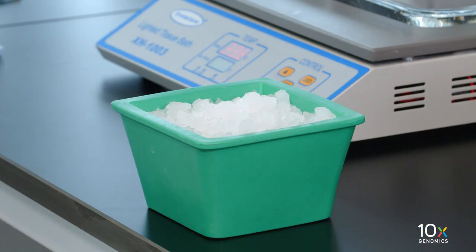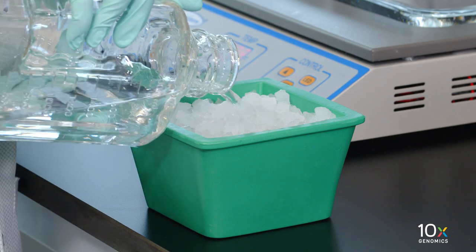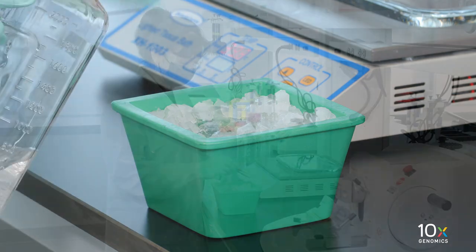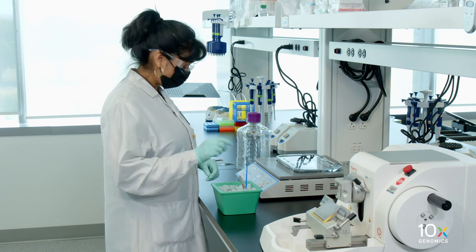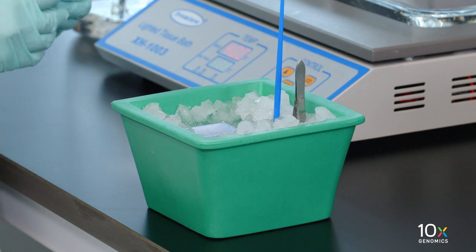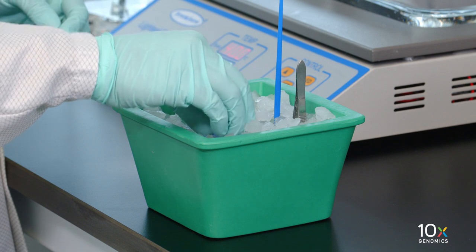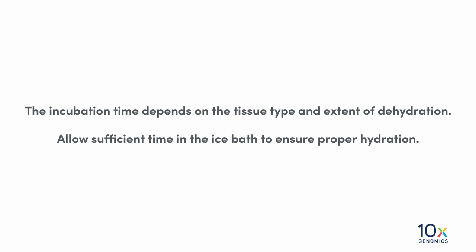Next, we will prepare an ice bath. Fill an insulated ice bucket with ice and approximately 100 milliliters of RNase-free water. Place sectioning probes, brushes, or forceps in the ice bath. For sectioning at 5 microns, place the tissue blocks in the ice bath and ensure that the tissue part is fully submerged.